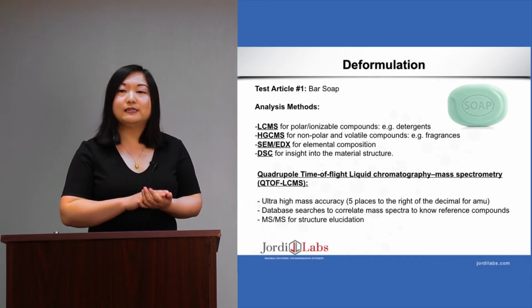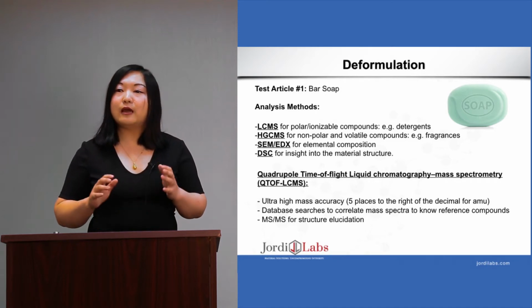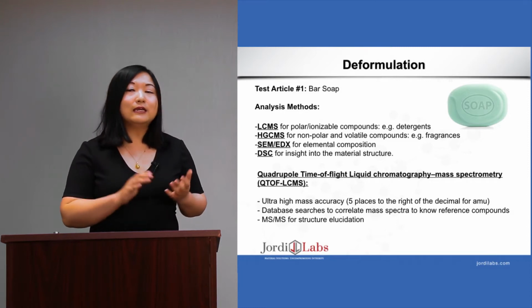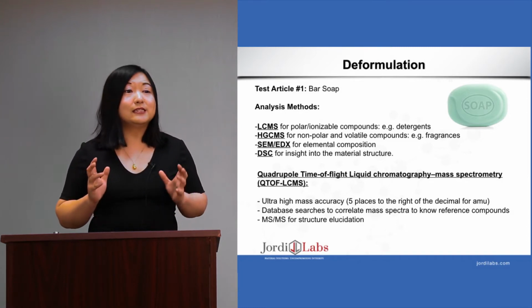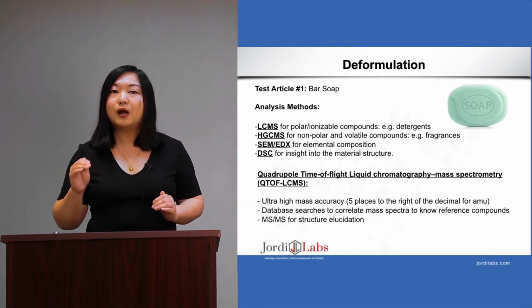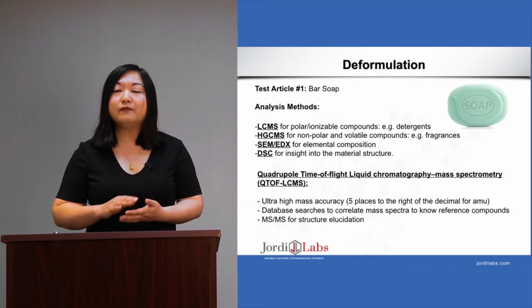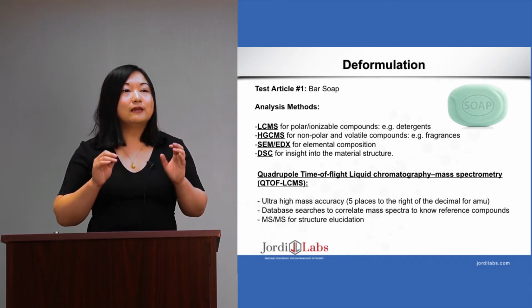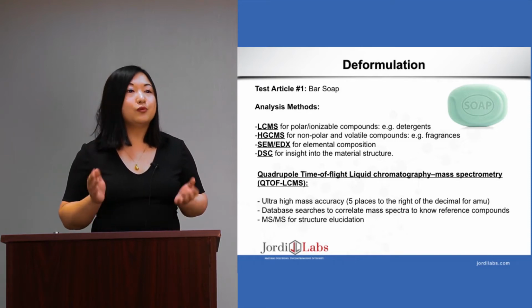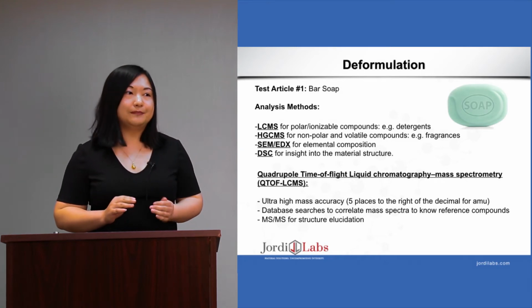This technique is very powerful for cosmetic analysis because fragrance and aroma compounds are widely applied in cosmetic products. Another advantage of headspace GCMS is its sensitivity. It can pick up signal at a PPT level, that's parts per trillion. This is very important because some of the fragrance compounds can significantly affect the smell of your product, even at a trace level. So we really need a method which can have a low detection limit.